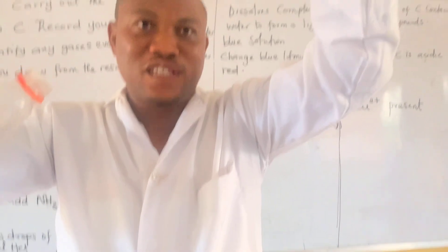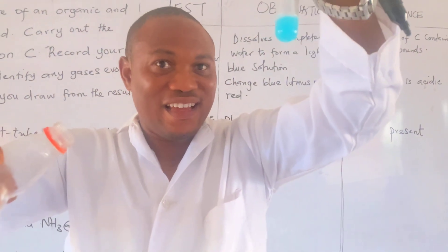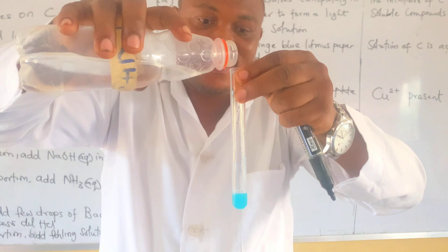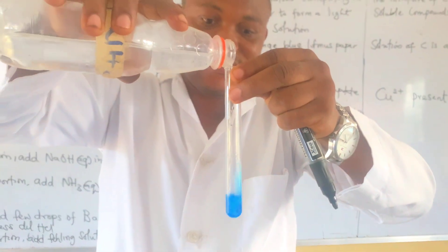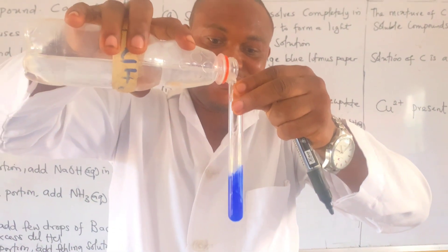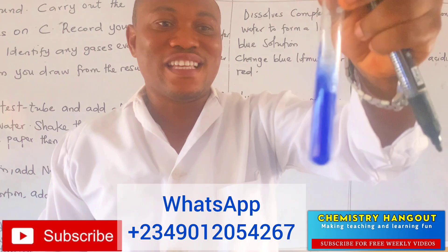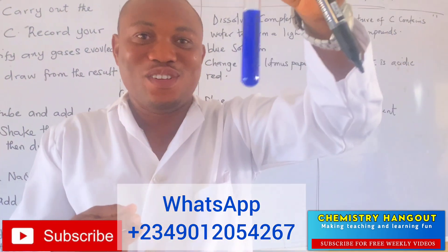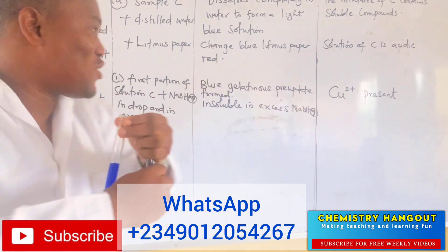Did you see that? I'm not seeing any precipitate here. So in excess — let's go in excess and see. Can you see? Everything dissolved. That's why it's a practical exam.